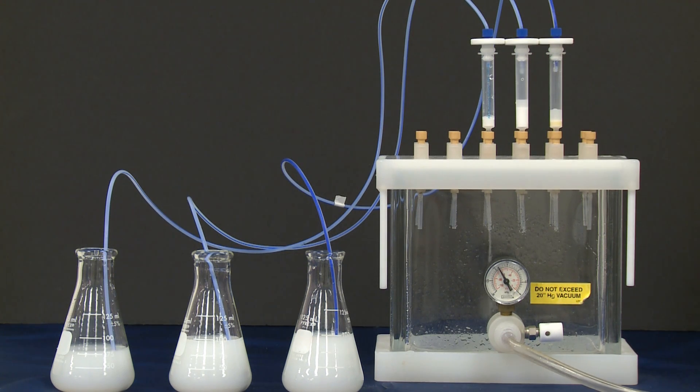As you can see, the Infinity SPE cartridge easily handles large volumes of high-TSS water quickly and without clogging.